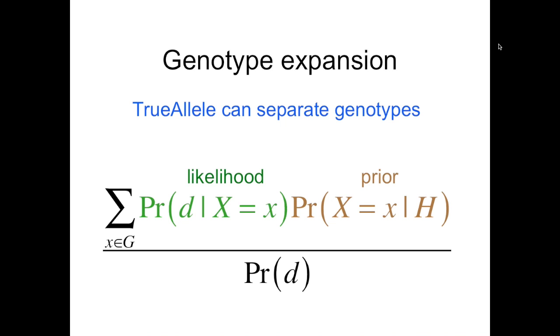Now, in the numerator, notice what it's saying. We have all these likelihood terms based on what the data is trying to tell us in green, and then the prior terms in brown have nothing to do with the data. They're based on our hypothesis. But what was our hypothesis? It was that the individual with the suspect S with genotype little s is the contributor and nobody else is. So that term will take on the value 1 for the suspect and 0 every place else.